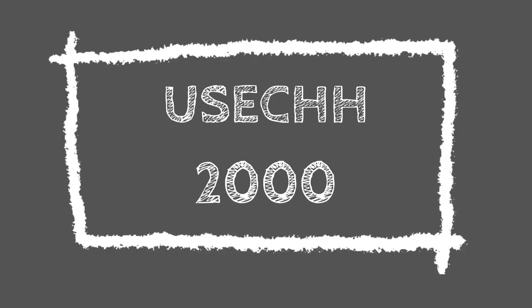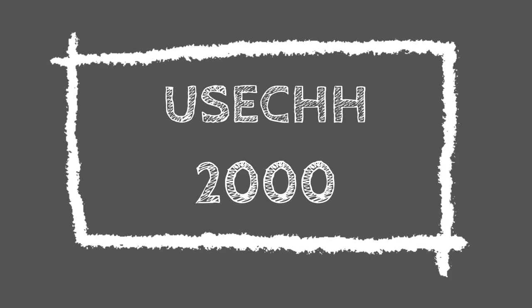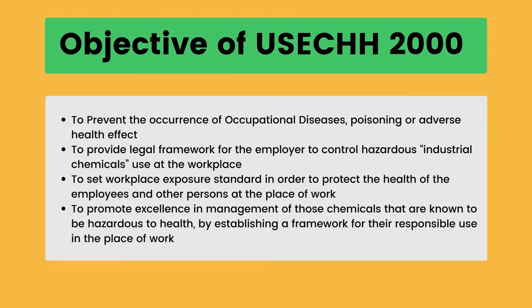Use and Standard of Exposure of Chemicals Hazardous to Health Regulations 2000, or USECHH 2000. USECHH 2000 was gazetted on April 4, 2000. USECHH 2000 is designed to protect the safety and health of employees and other persons from being affected by chemicals hazardous to health used at the workplace.